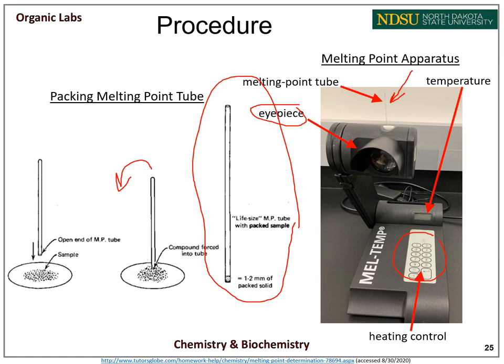When determining the melting point of caffeine, you want to record a melting point range. The melting point range is when you see the first drop of liquid form when the caffeine starts to melt to when all of your sample has been converted to liquid. And this will conclude the lab.